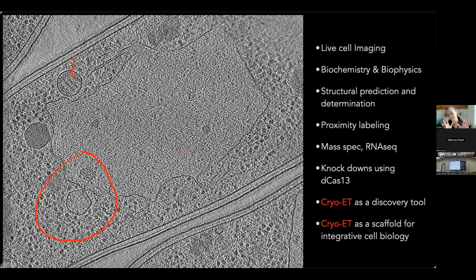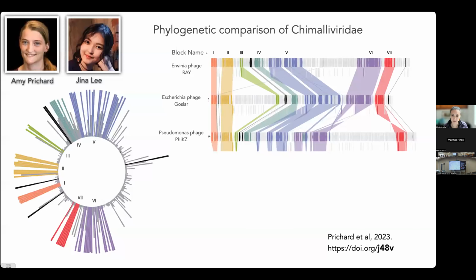Just want to say, we put together with Joe and Kevin and Kit a lot of different techniques that we basically apply to this process. It's a lot of fun because we're typically, I didn't even show you some FRAP data and stuff, just looking at things like, for example, this phage that seems to have a genome organized inside the nucleus that then gets, like you see here, a single molecule of DNA going into the phage. So what is this protein? And then we go and chase it down, and then it ends up being a weird thing.